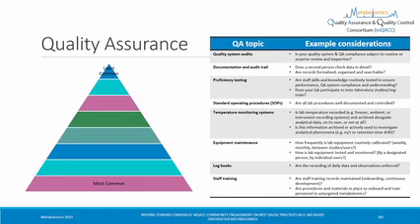And here QA serves to drive efficiency in the organization. Things like liability and accountability may be coming into play here, where they're less so in the PI-driven lab, where if something goes wrong, you just collar the student, they do it again, right? And that is a way of assuring quality. But there are different systems for different scales. So I just want to dispel the myth that you can't do good quality work if you don't do all of these things. It's all about being, as Jonathan said, fit for purpose.